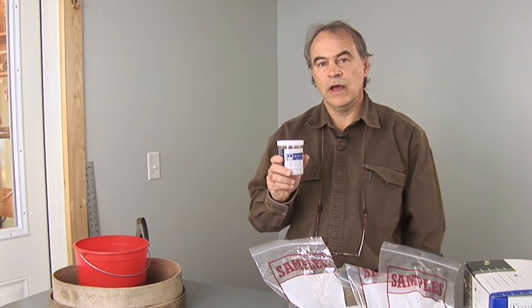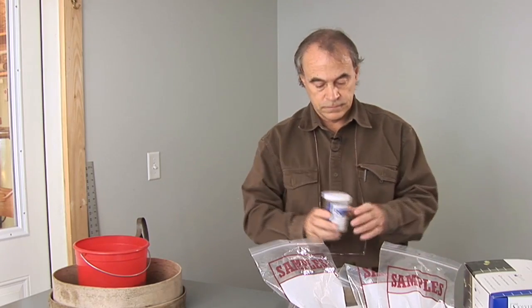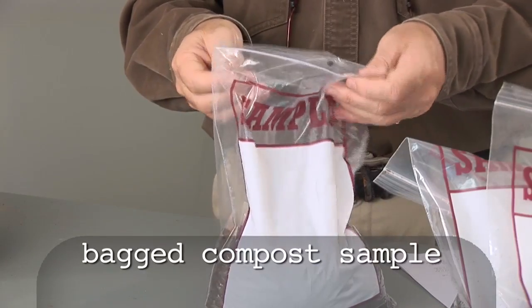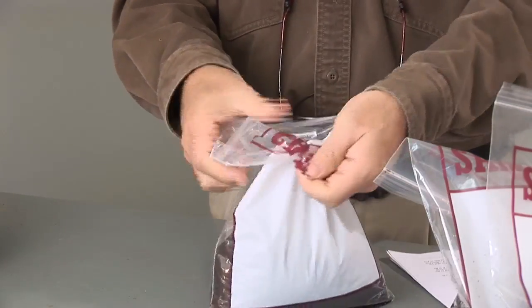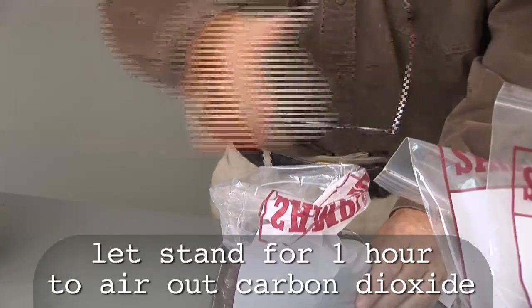Here I am going to demonstrate how to do your own compost test using the Solvita kit. Let's assume the compost has been taken in a proper manner. If it's been bagged, open it up and allow the accumulated carbon dioxide to air out.